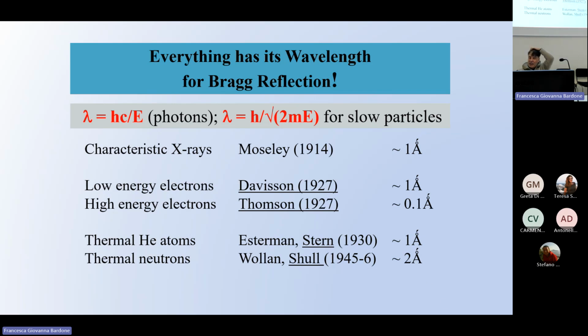But this is just information in physics. I mean, since you know the diffraction limit, you can think of a particle, you associate to the particle the wavelength, and you can create whatever, but it's not very useful. This was done just to show that the working principle was right.